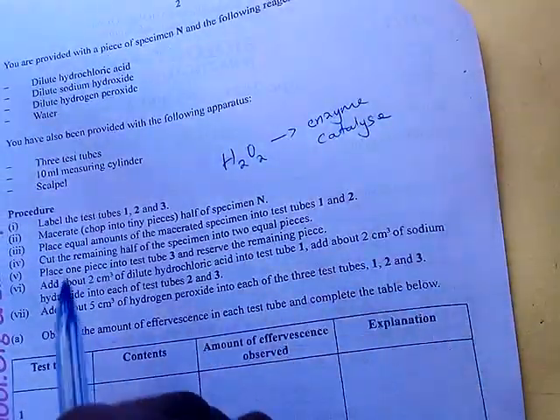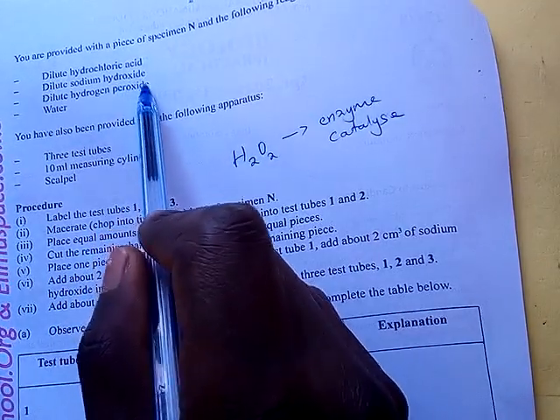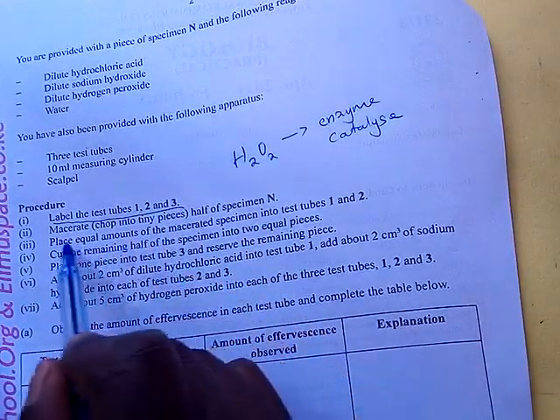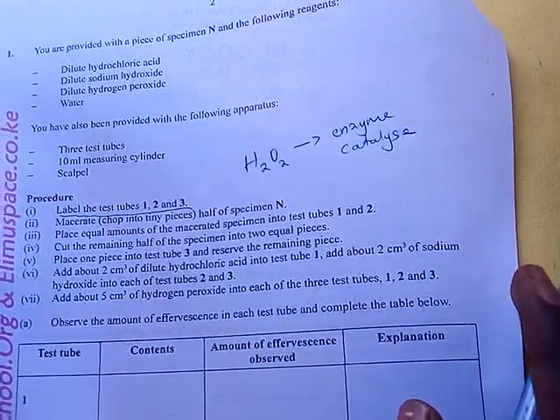Now let's start the procedure again. You are provided with these reagents. When you have labeled the test tubes, to macerate is to cut into small pieces.